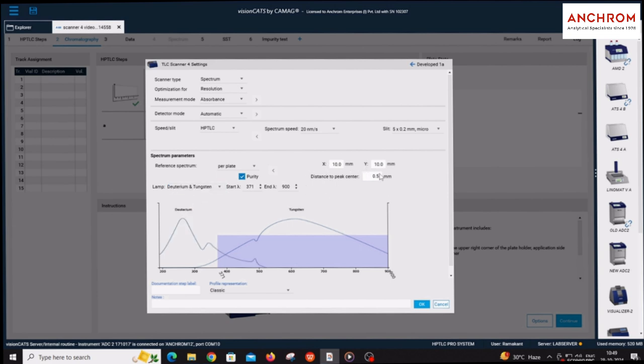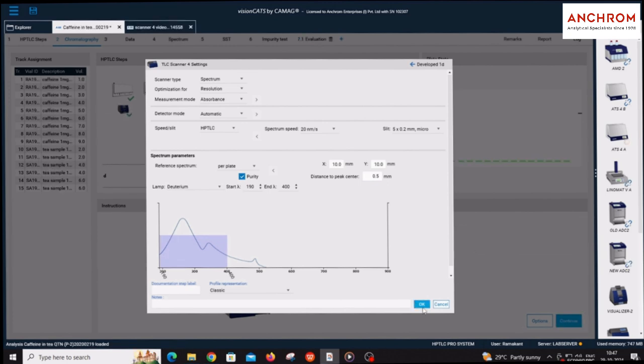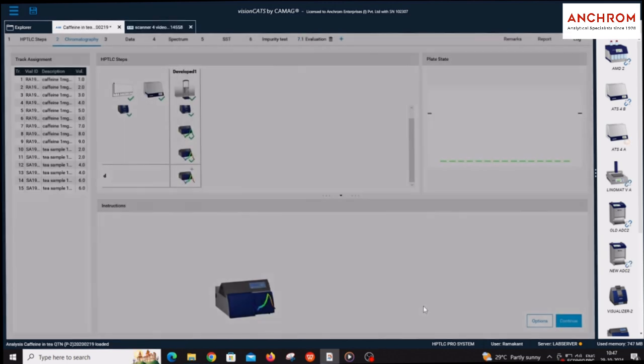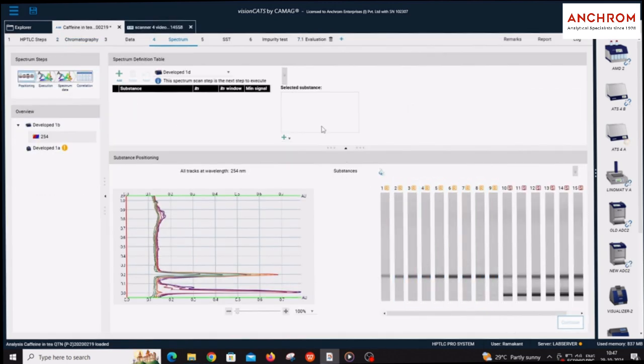X, Y, and distance to peak center is kept as by default. After filling the parameters for the Scanner 4, click on OK and continue to proceed with the spectrum step. You will be directed to the spectrum tab.